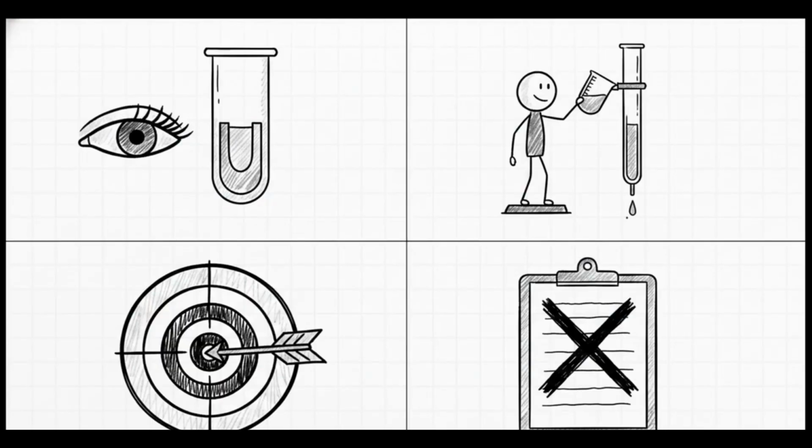Let's pause here for some crucial examiner tips, because examiners love testing this practical knowledge. A great trick is to aim for a titre of around 25 cm³. This specifically reduces your percentage error. Always read the burette at eye level from the bottom of the curved meniscus, and make sure you fill it below eye level for safety. And the ultimate secret to keep in mind? Never include your initial rough titration when calculating your mean. Just leave it out entirely.